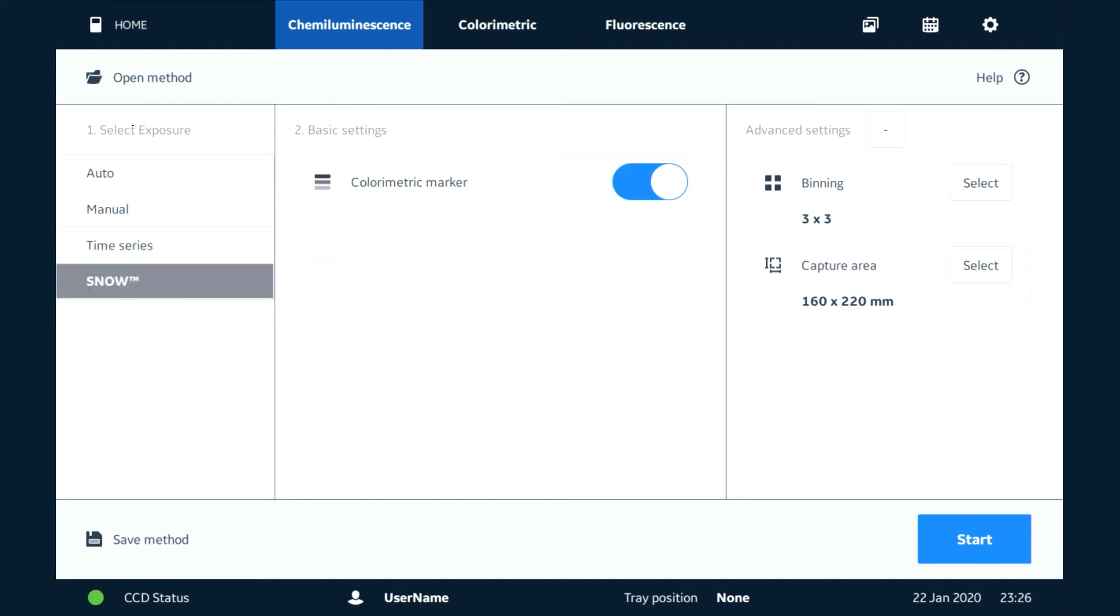There's another cool mode here which is called snow. With snow we're able to extend the dynamic range by minimizing noise in the system, and this is really a fully automated way of working with the system.